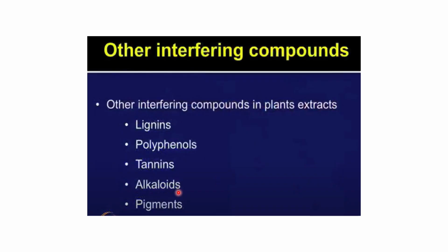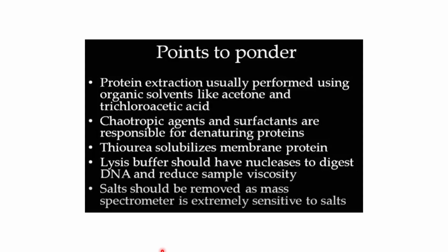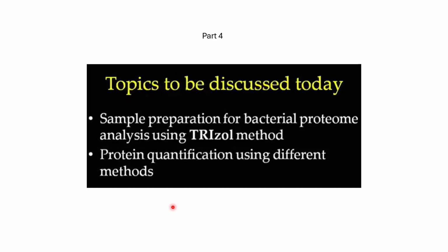These are some other interfering compounds, and there are techniques available to remove them too. So that is what we discussed in part 3.